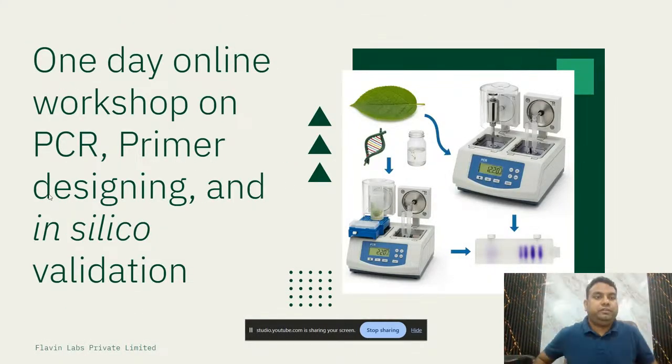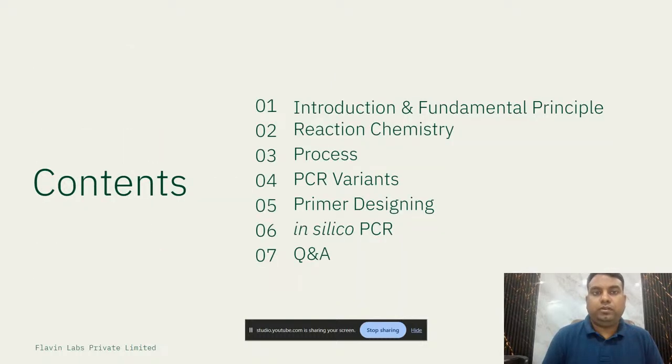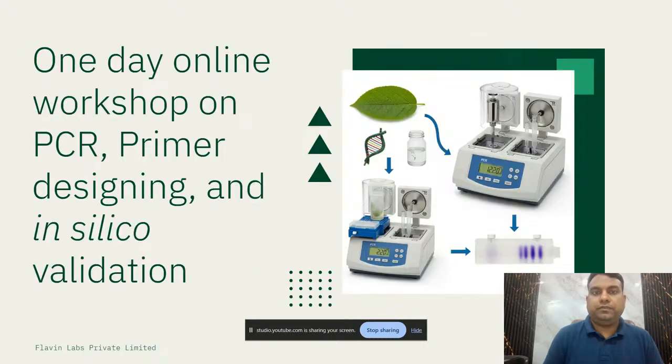Good morning to everyone. Hope my slide is visible to you. Today we are going to cover basics of PCR, primer designing, and in-silico validation. If you are a student of life science, especially biotech or microbiology, then you must have heard about PCR. PCR is a very important technique for life sciences.